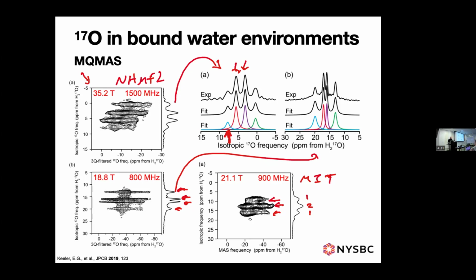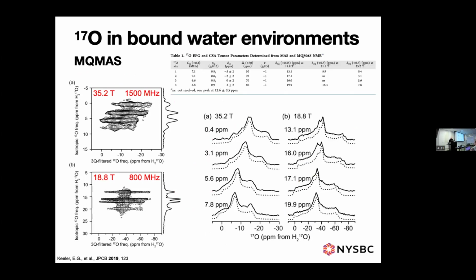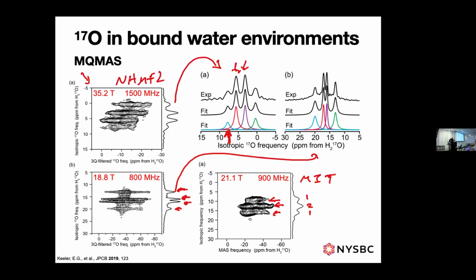Those 800 spectra look so good. Yes, the 800 spectra also look really good. What happens if we look at this just a little bit closer? I was just wondering though, you know, you're interpreting the intensities and I was expecting you were going to give some kind of caveat around that. What's your feeling? On balance, it's probably as good as another NMR intensity.